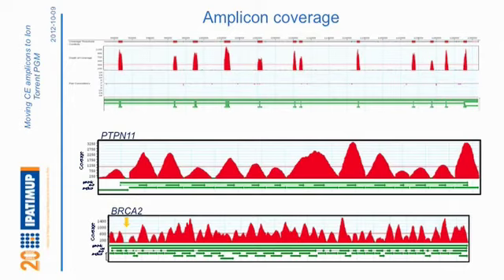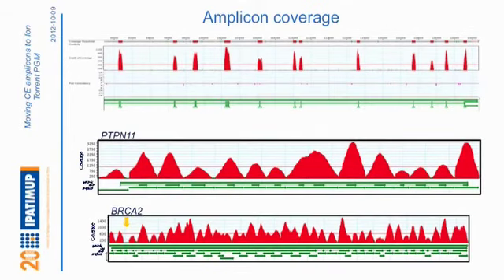So from this picture here, you also see that we were not very much worried about how uniform this amplicon coverage was. We were more worried about not having amplicons left uncovered, instead of having them all with uniform coverage.